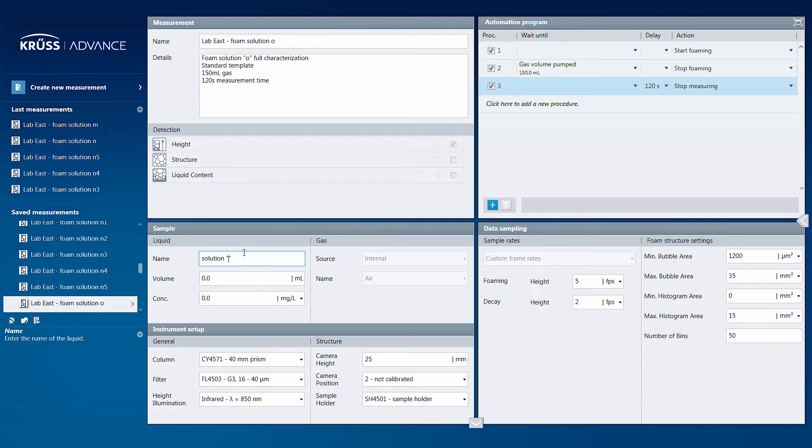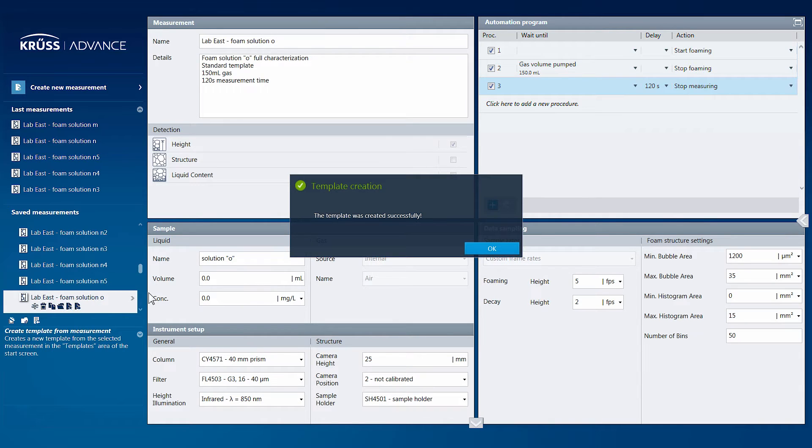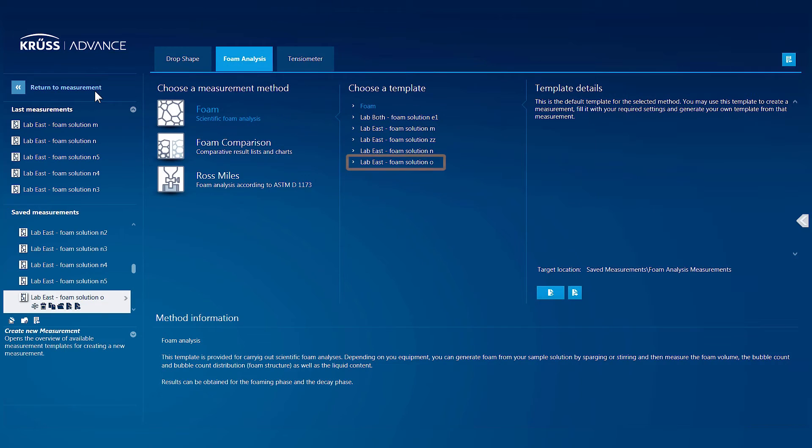When you make changes to the measurement, you can save the new measurement as a template with one click, which will appear on the start screen with the other templates for that measurement method.